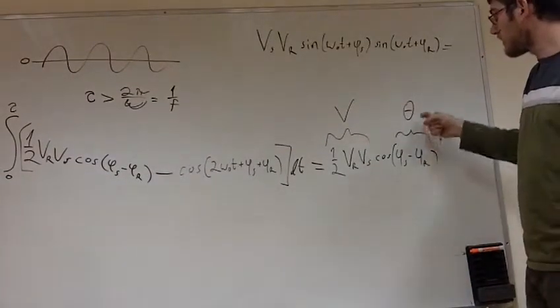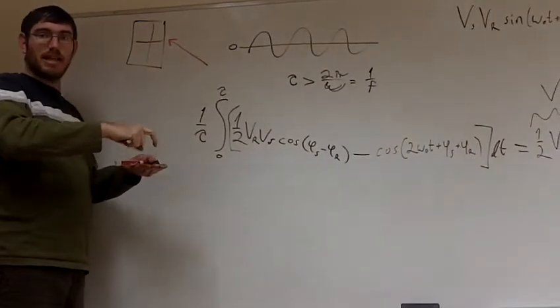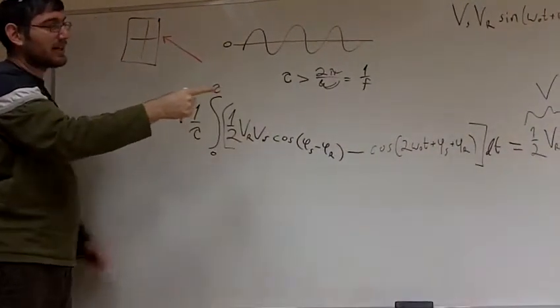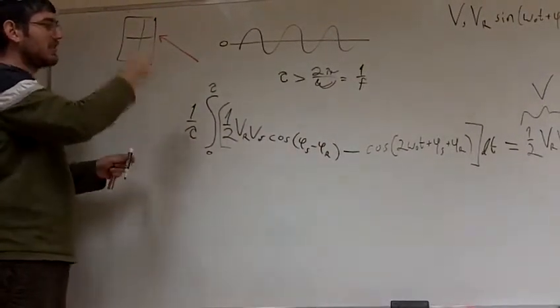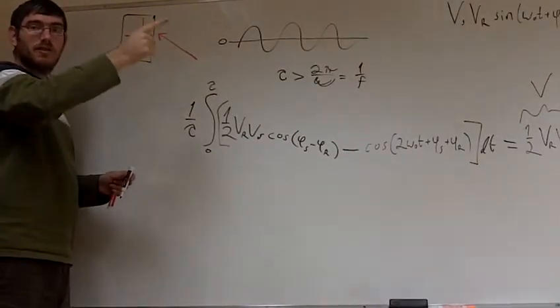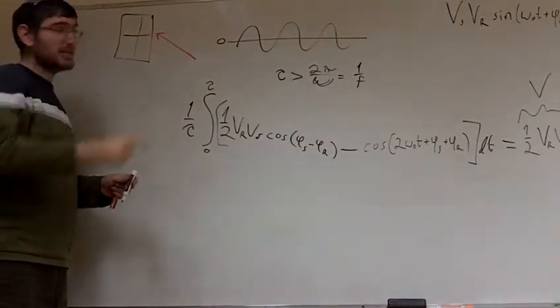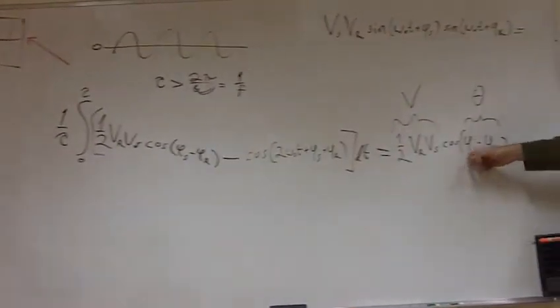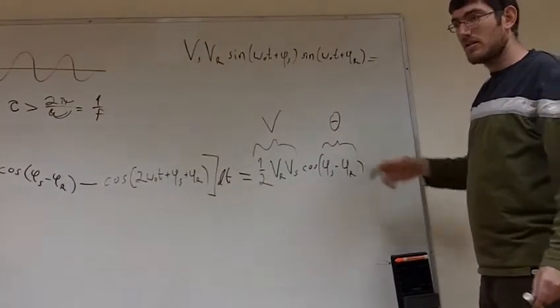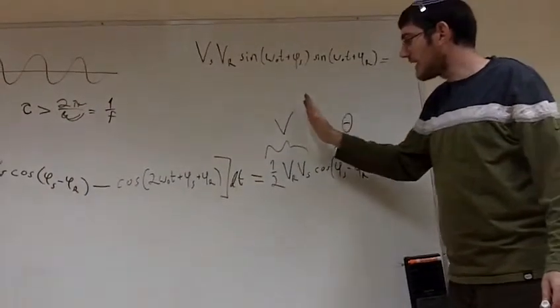Now we can also monitor a change in the phase. When there's an interaction between the tip and the sample, even if the amplitude won't really change, there will be a shift in the phase. Let's say it's oscillating like this, and suddenly when there's a force it stops for a second or changes a little bit, and then oscillates in a different phase. So there will be a change in the phase of the signal, and then this value will change. So in the lock-in we're looking at a phase change or an amplitude change.